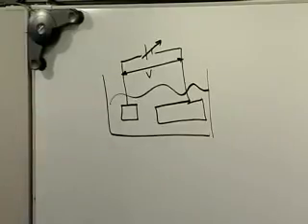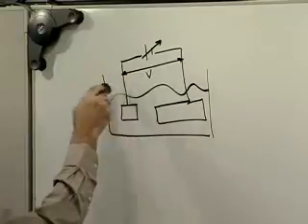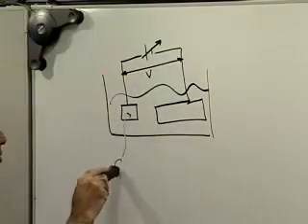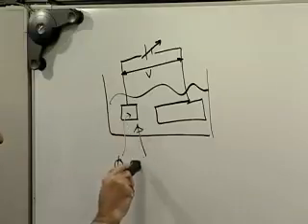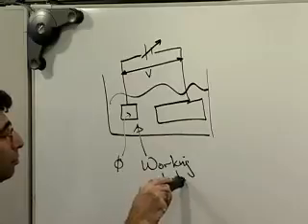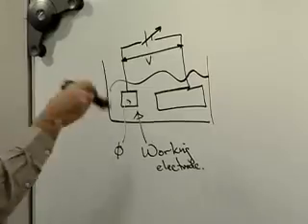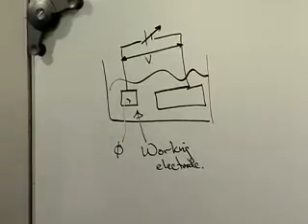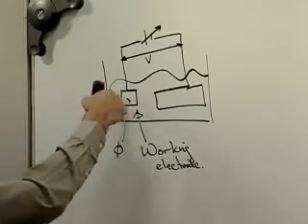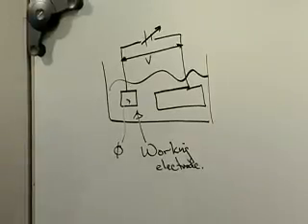Typically, you've got lots of possibilities, and the way we want to access those possibilities is by not controlling the voltage, but controlling the potential of this electrode. We'll make this our working electrode. So if we can control that well, then if there's 29 different reactions that might happen, presumably we could pick out the one that we were interested in, by knowing exactly what potential would give us a rate constant for the reaction of interest that would be suitable, and not rate constants for other reactions that would be suitable.